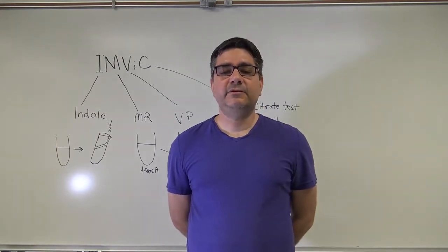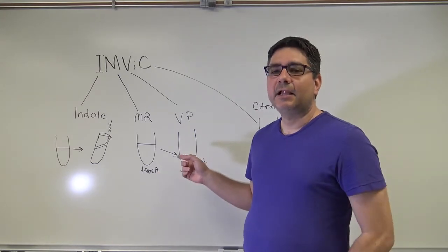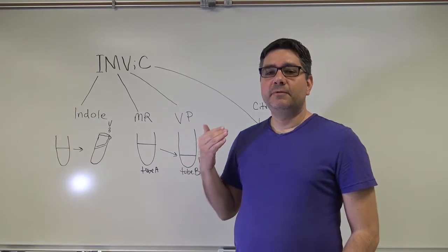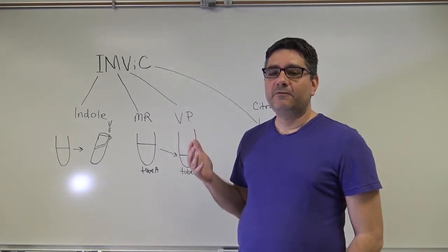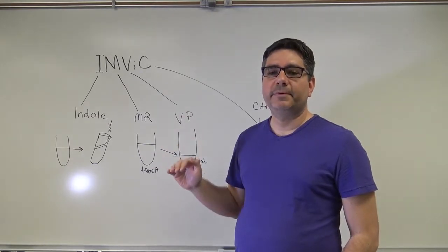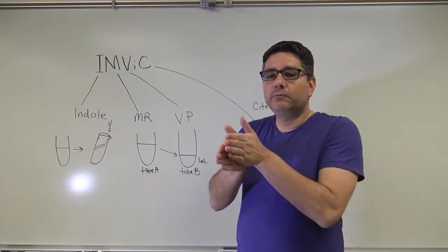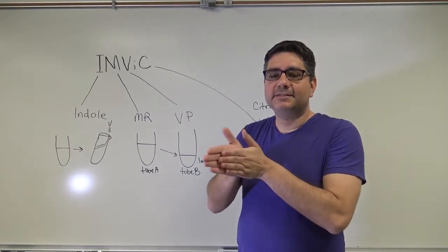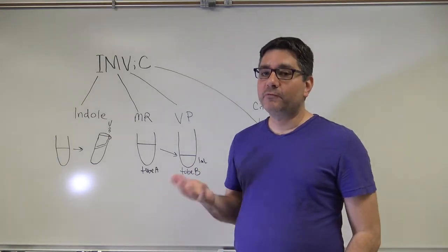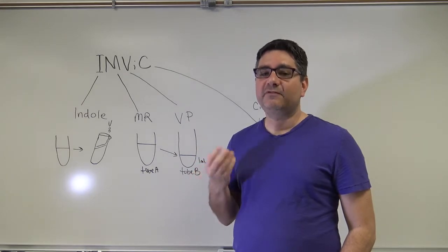When conducting the indole test, you will tip your tube, as indicated, to the side, allowing 2 to 3 drops of the Kovacs reagent to the medium, allowing the Kovacs to slowly form a layer on the surface of your culture medium. Next, you will cap the tube and slowly rotate the tube in your hands. Organisms that are able to break down tryptophan will turn a reddish color after addition of Kovacs, indicating that the indole was in fact produced.